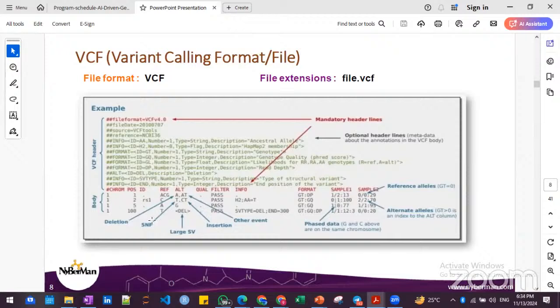processing mutation data, or you are trying to identify mutations in your data, you must also know that there is an alteration in the nucleotide on the same gene. You can see in the figure, the first row in the body is ACG. If it is visible to you, that will be great, because here I have added that REF stands for reference allele.